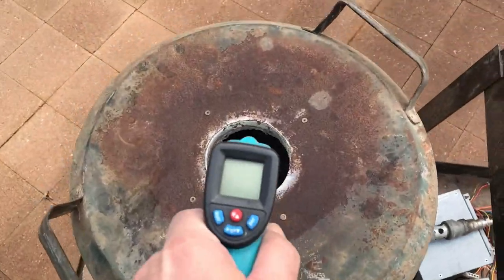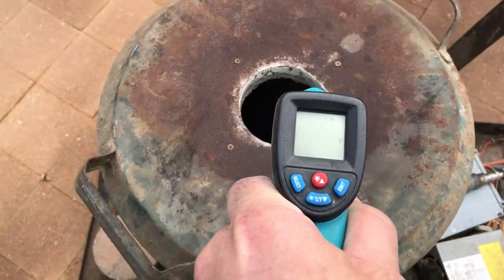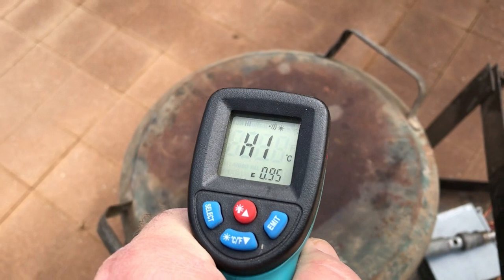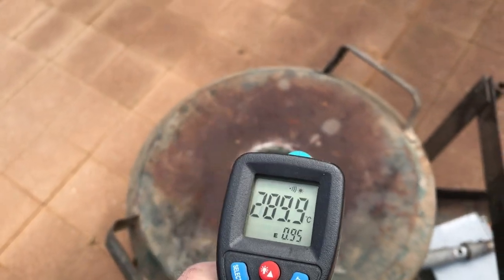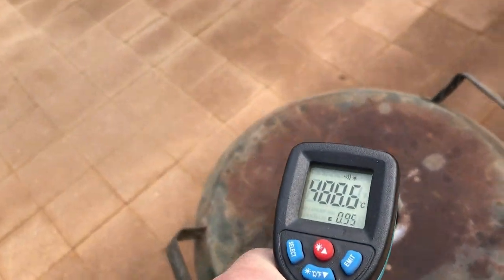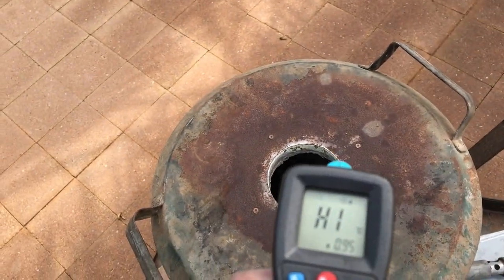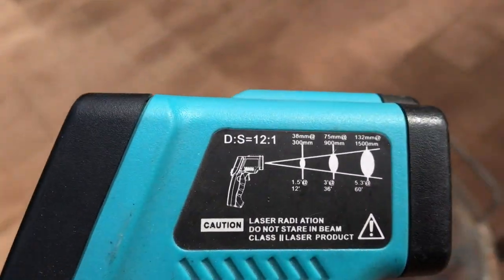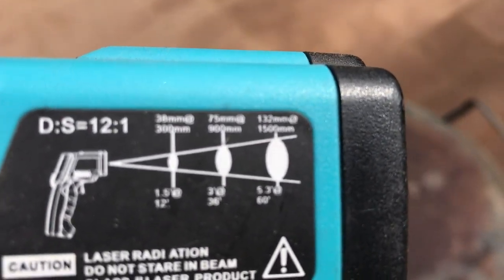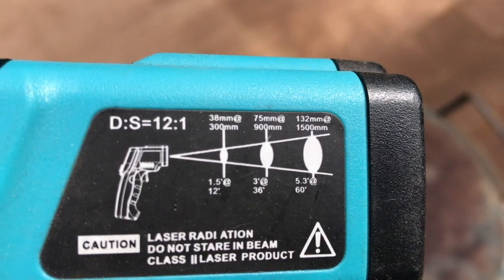The furnace has been on for an hour and we're already at 500 degrees. Keep away from that furnace. So this goes up to 500 degrees and then we can sort of work it out by the distance.